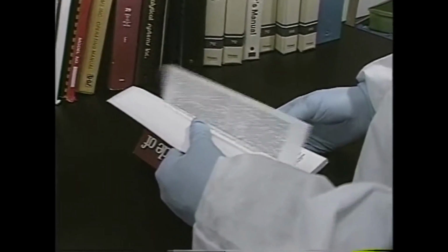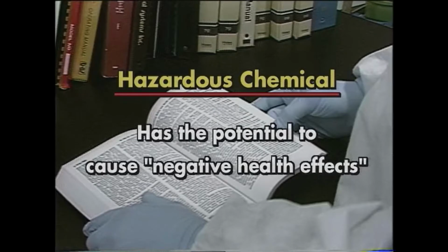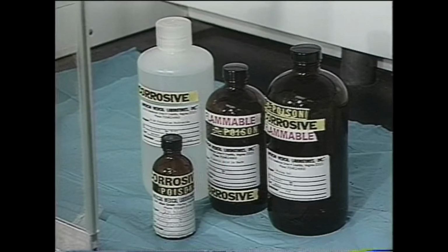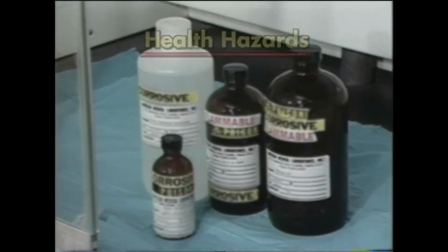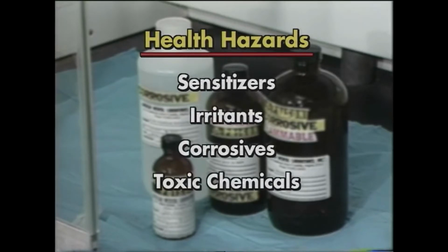For the purposes of the laboratory standard, a hazardous chemical is a substance that has the potential to cause negative health effects. Chemicals can be divided into 5 categories based on the type of health hazard each presents: sensitizers, irritants, corrosives, toxic chemicals, and carcinogens.